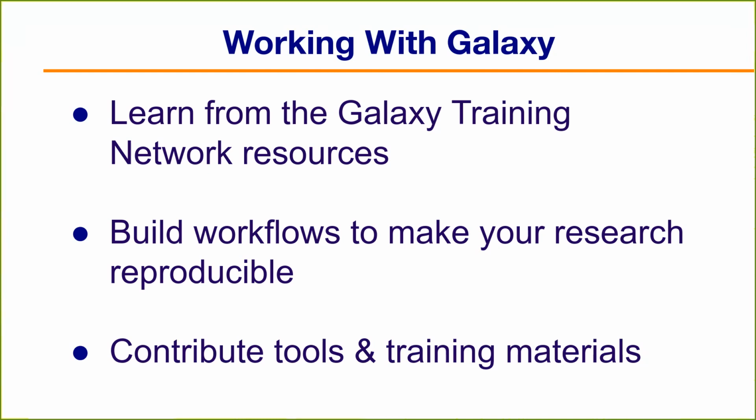And then, of course, as I said at the start, you can contribute tools and training materials. So if you, for instance, are working on a new bioinformatics tool and you want more people to use it, you want to provide a graphical user interface to it, then add it to Galaxy. It's an easy way to get a bigger audience for your tool. And then if you want to grow a community of people working on your topic of interest, so for instance, you want to grow more people working on Plasmodium falciparum bioinformatics, then contribute training materials so that it's easier for people to learn how to work with the topic in question.